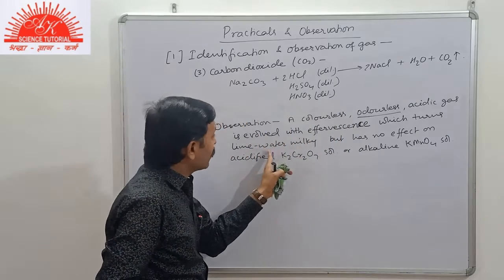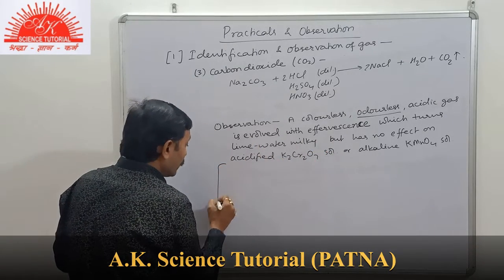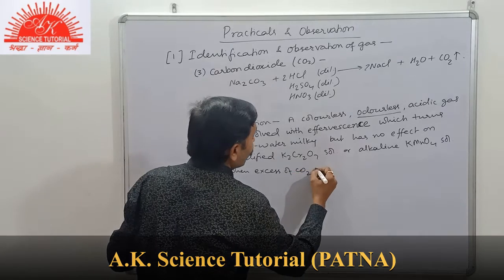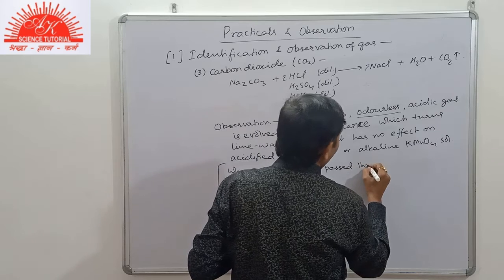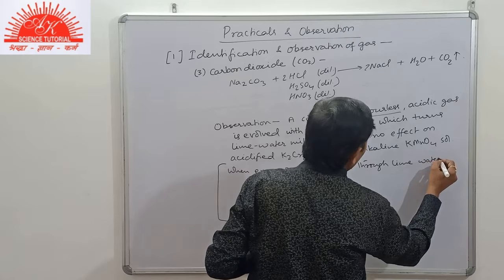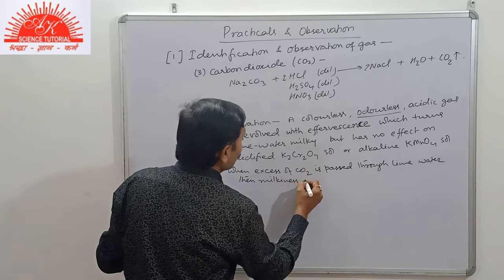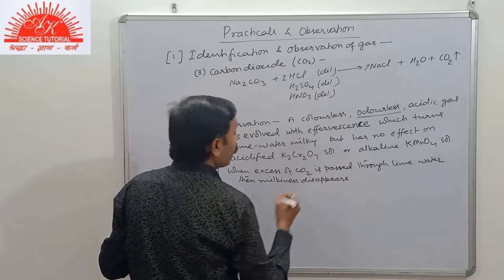Now here we have used the terms has no effect, turns lime water milky. But when excess of CO2 is passed through lime water, then the milkiness disappears. Now what is the reaction?